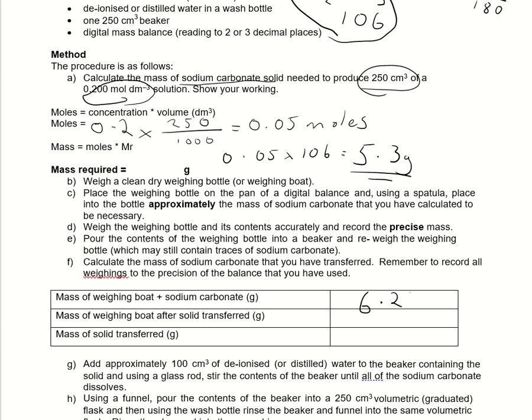Let's say I weighed out 6.2 grams. I'll say 6.20 just for the balance. And then the mass of the weighing boat after the solid's been transferred, we'll say is 0.70 grams, like I said. To get the mass of the solid we've transferred, you do 6.2 take away 0.7, and we'll say I've weighed out a little bit too much, 5.50 grams. That's perfectly fine because it's reasonably close to what I wanted initially.